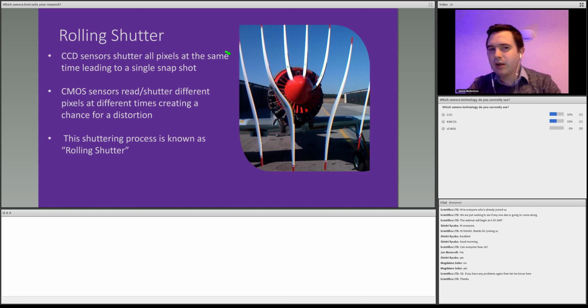Or does it mean the whole cell happened to be bright when the rolling shutter was at the top? In a lot of cases it won't make a difference, but in those cases where it does, it is well worth considering because you can really get false results.